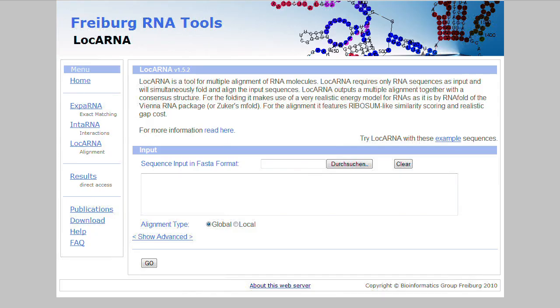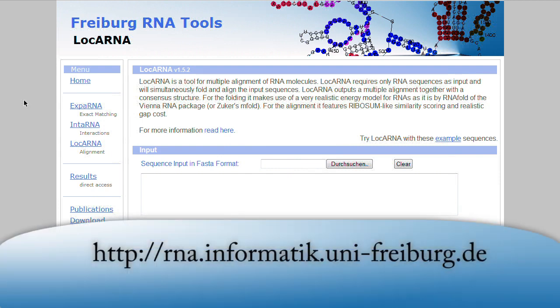Here you can see the Freiburg RNA tools web server, where you can try Locarna directly online. I want to show you how easy it is to use Locarna via this web server. The server is available under rna.informatic.uni-freiburg.de.